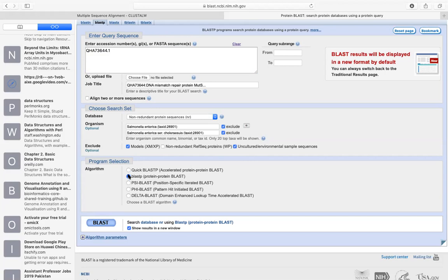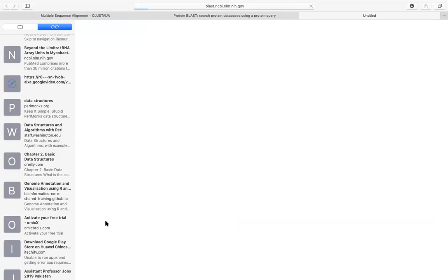What algorithm do we want to use? BLASTp — because it's a protein, we use protein BLAST. We will run the BLAST and not go into the algorithm details because this is not a BLAST lecture — we have done all this before. Just click here. The page is running. What are we doing? We are preparing for multiple sequence alignment using ClustalW, and we need sequences, so we are retrieving data from NCBI.